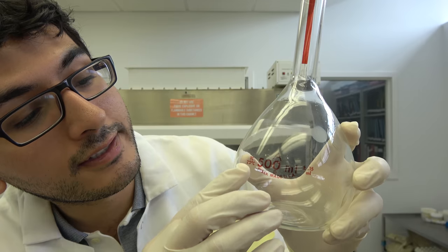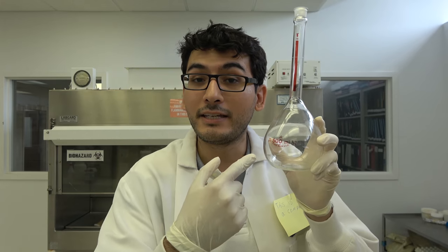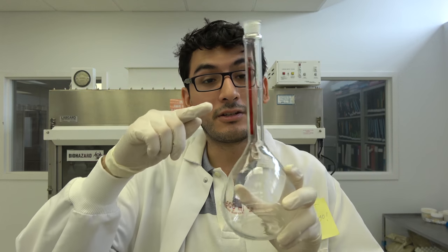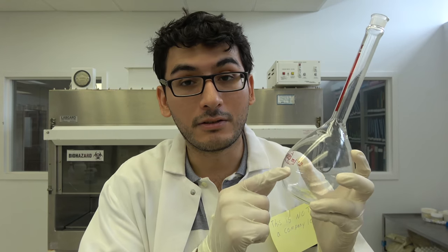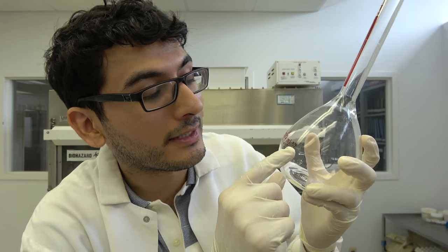Now these go hand in hand. These are class A volumetric flasks. Same principle. It's just really accurate. You can read on here it says TC 20 degrees Celsius. That means that ideally under 20 degrees Celsius this is going to be 500 milliliters. And you can also even see plus or minus 0.15 milliliters which is just the tiniest variation that it can possibly be. Now why would you want to use these? Well for one example if you need to make a series of standard solutions for some kind of experiment. A standard is a standard for a reason. You need to be as accurate as fucking possible.